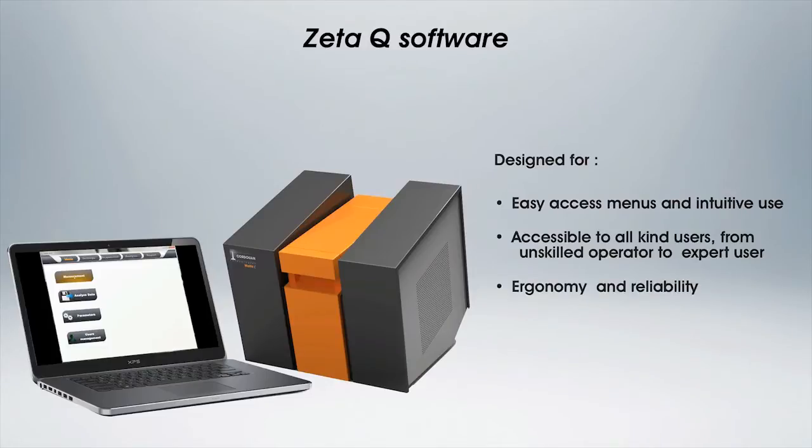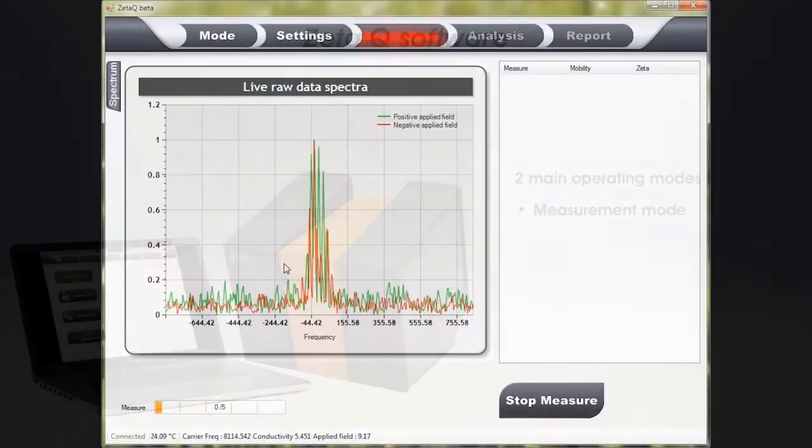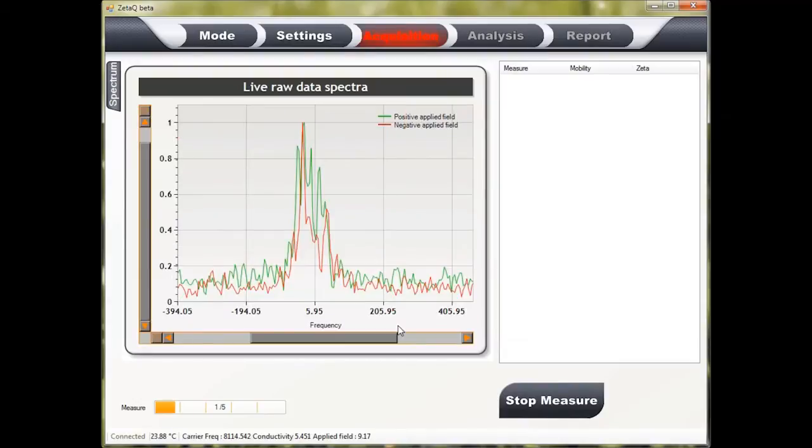Zeta-Q proposes two main operating modes. The measurement mode allows starting a measurement in few clicks either in a continuous way or in a multi-acquisition session for size kinetic study.